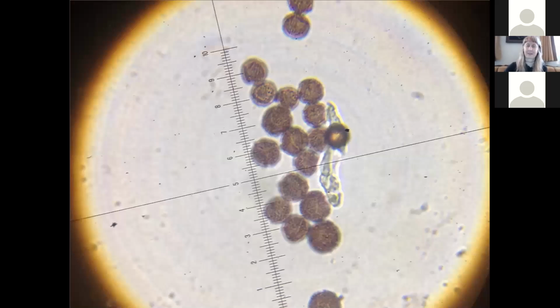Okay. So here's what it looks like when you're looking through the eyepiece, the reticle that has the little ruler in it. So if I was looking at this and I know that I'm looking at it under 1,000 times magnification, and here's the spore, this spore is about 10 microns wide. So that's your measurement for that.